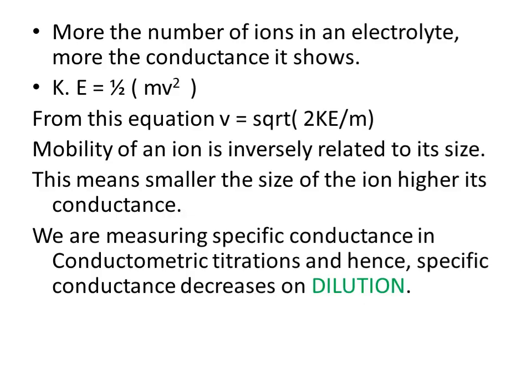Then number of ions: the more the number of ions, the more the conductance. This is very easy. If on a particular day only one student is there in your classroom, he can't make any noise. He will just go to his place, sit quiet and calm and do his work. If he wants to leave the class, he'll go out. That's it. 2 students, they can have some chit chat. 3, some noise. 30, wonderful noise. So the more the number of ions, the more the conductance.